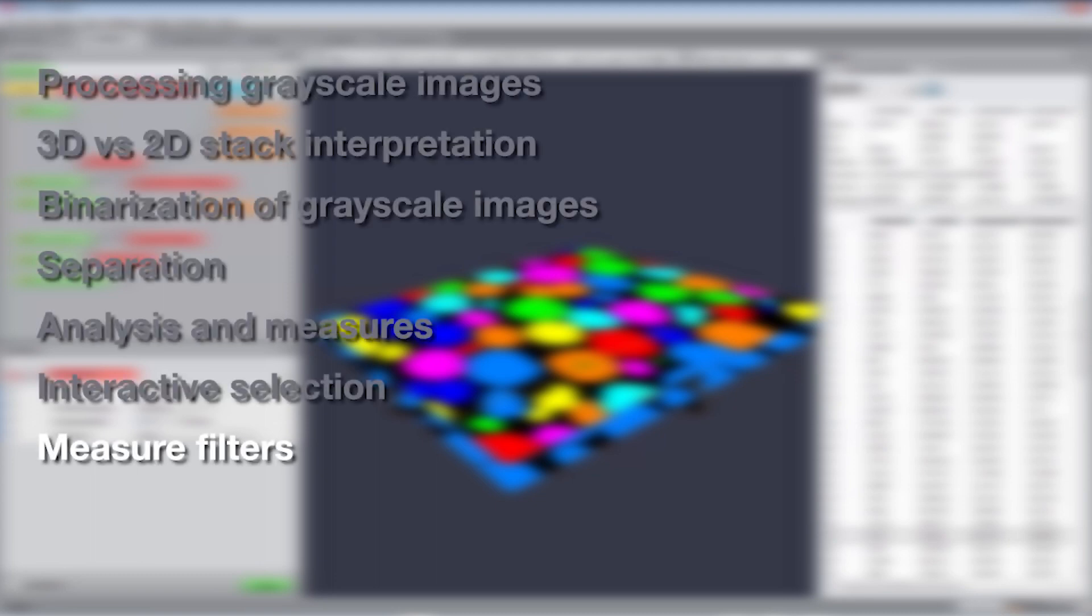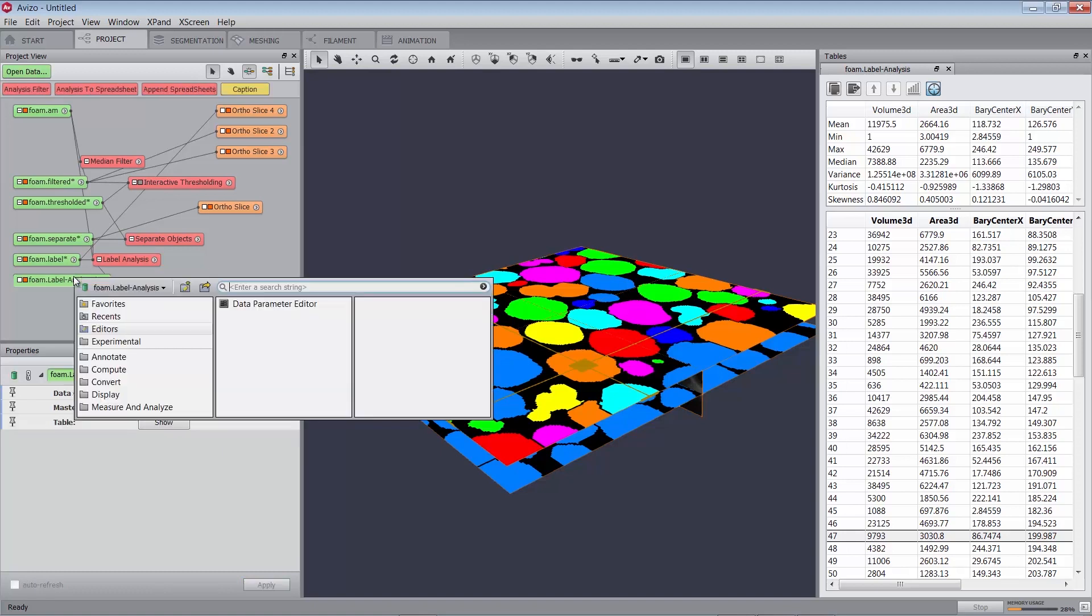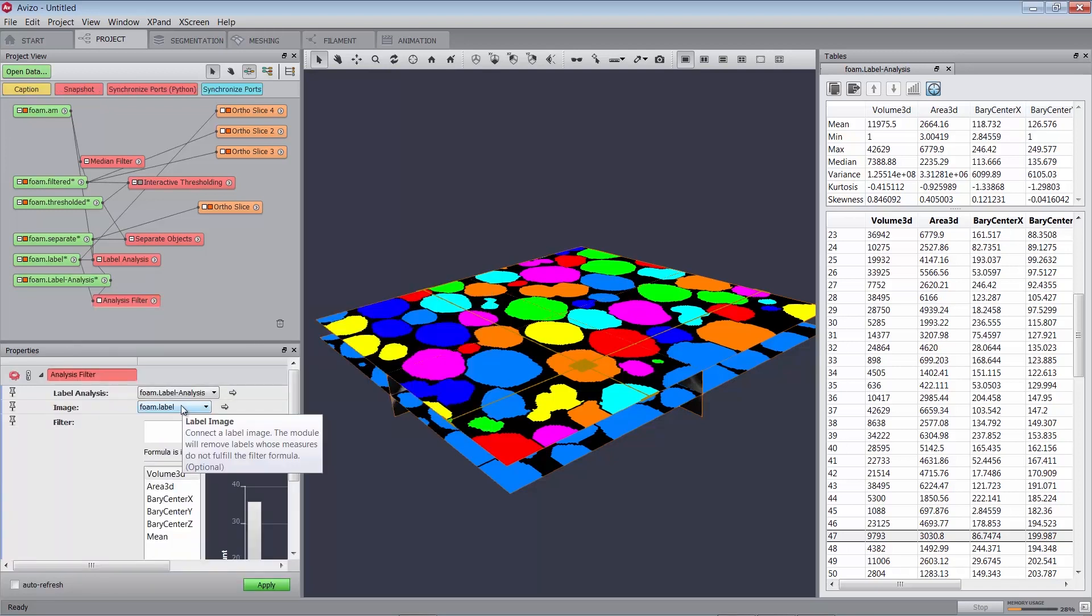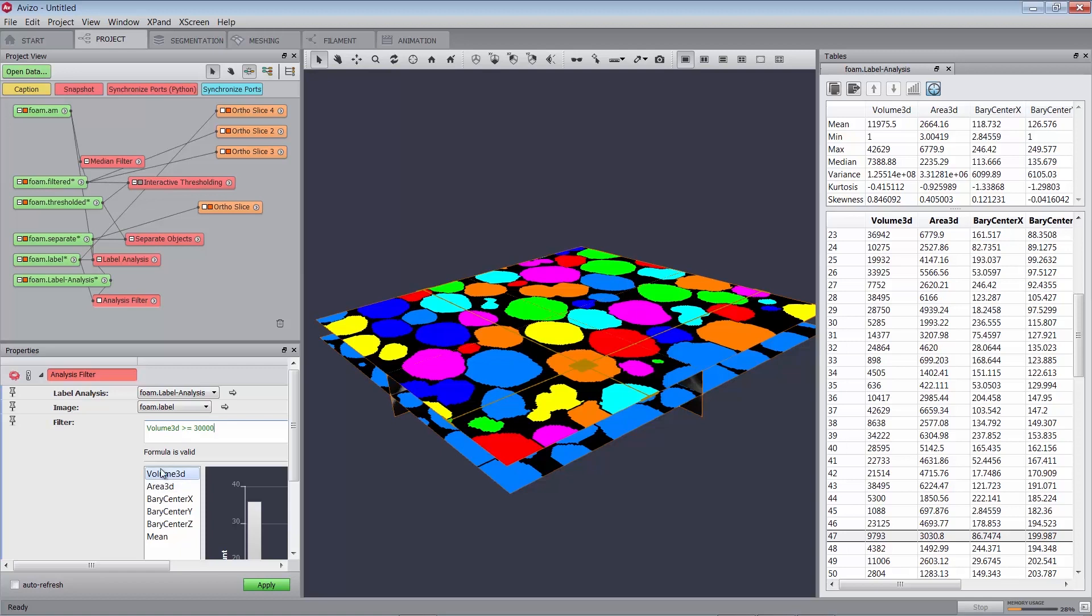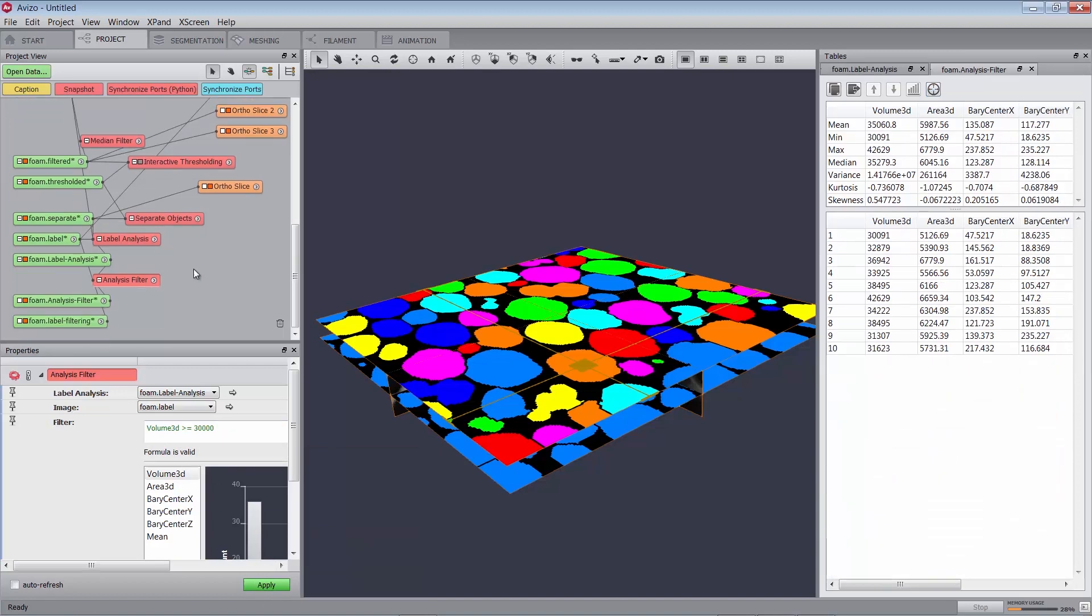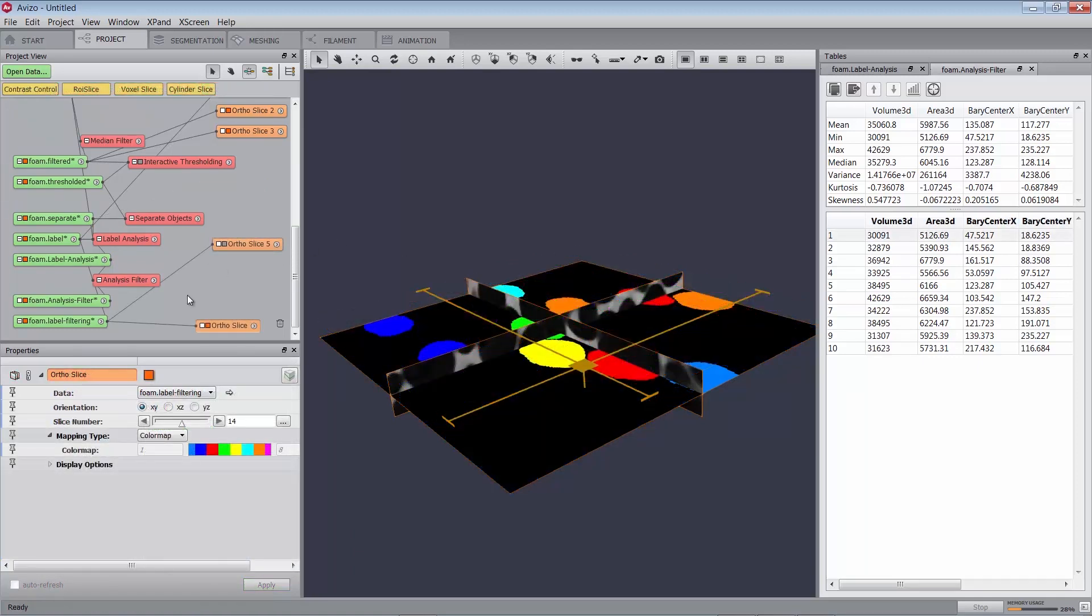Filtering based on measures. You can filter particles displayed in your 3D viewer. For example, you can decide to visualize only particles which volume 3D belongs to a specified range. Attach an analysis filter to foam.labels-analysis. Connect the image port to foam.label. Create a new filter by entering volume 3D greater than or equal to 30,000 in the filter port. To insert volume 3D in the formula, you can type it or double click on it in the list displayed below the formula field. Press on the apply button. This creates a new analysis with fewer objects. You can verify that fewer objects have been created by connecting the ortho slice to a new label image foam.label-filtering.